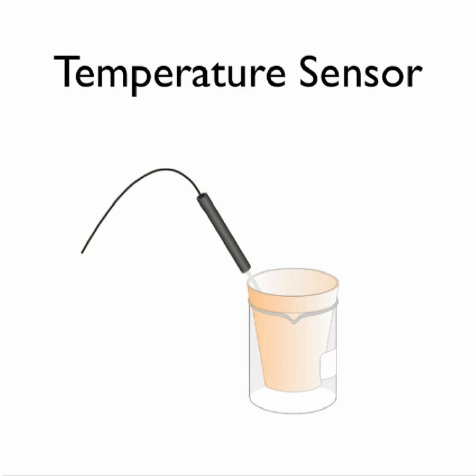The data collection will automatically stop after 3 minutes. Then examine your graph to calculate and record the maximum temperature change. Then rinse out and dispose of this reaction mixture. Repeat the necessary steps to continue testing various ratios of the two solutions, keeping the total volume at 50 milliliters. You do this until you have 3 measurements on either side of the ratio that produce the greatest temperature change.